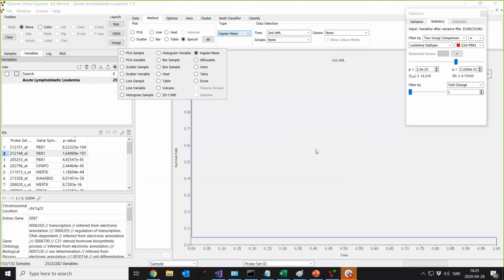Here I got a question for someone. How do I manage zero values in my file? I suppose you are asking when you have a value which is zero or a value which does not exist. Is that what you're asking, the person who asked that question? Okay, that's a good question.